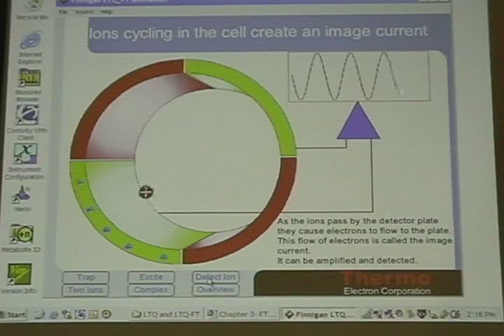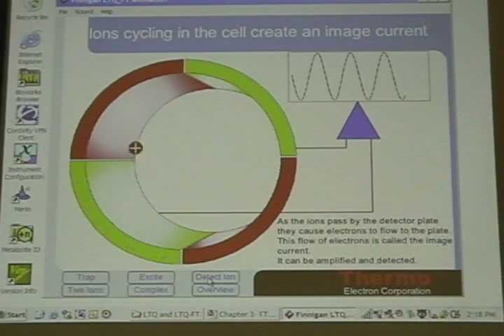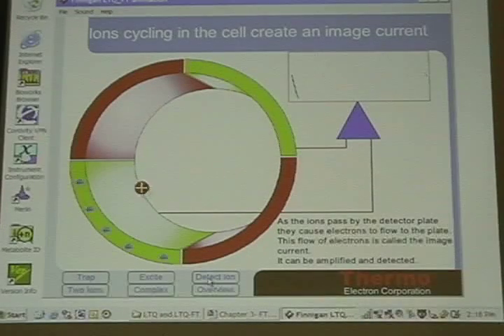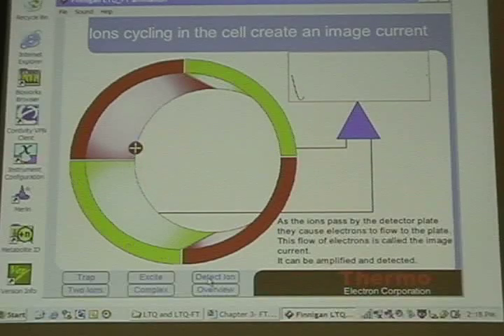So how can you know the exact frequency of the ions? Yeah, how do you eliminate space charge once it's occurred? Because in any complex mixture, there are going to be ions passing by. Just run a low ion population so your space charge perturbation is below what you're looking for in mass accuracy.